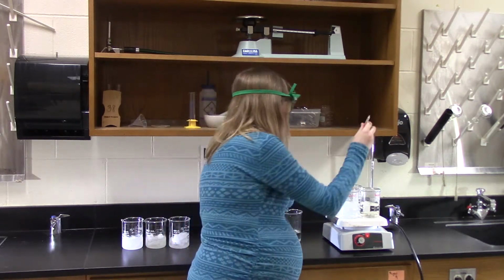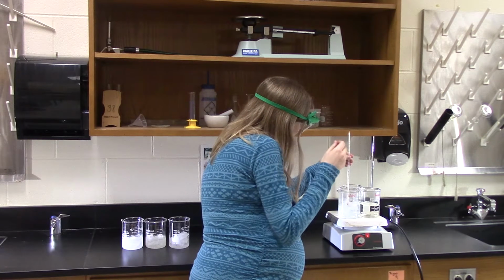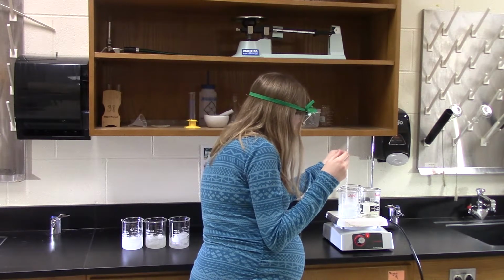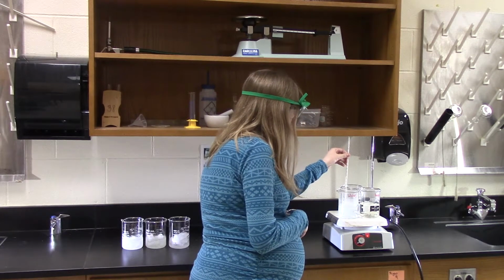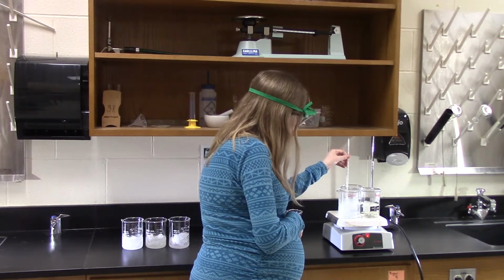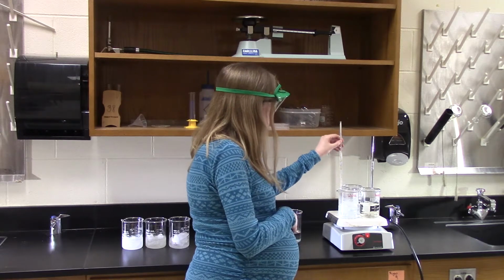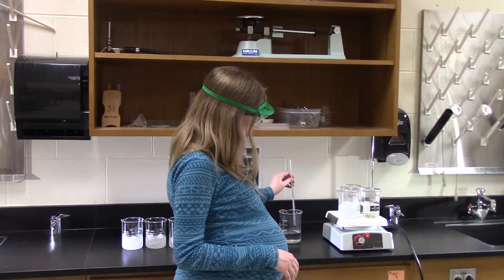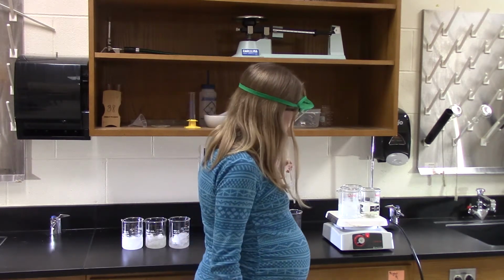Okay, let's have a look. So here's the water by itself. Oh, wow. Okay, its boiling point is 99. That's pretty typical. It's usually pretty common for you to see something just below 100. So we're starting with water at 99. And I'm going to rinse off my thermometer between all my measurings.